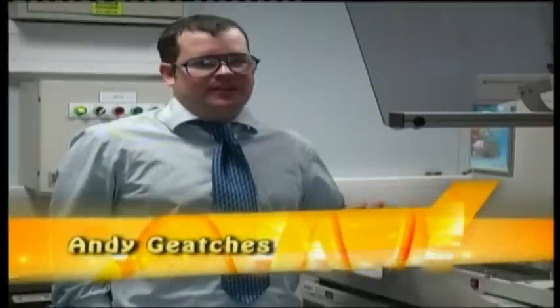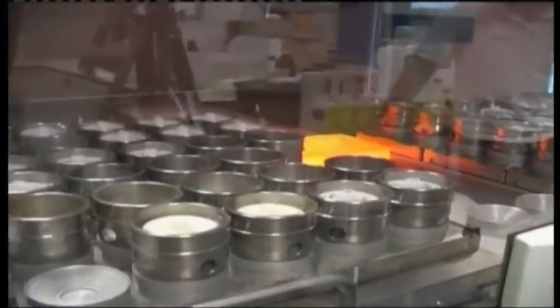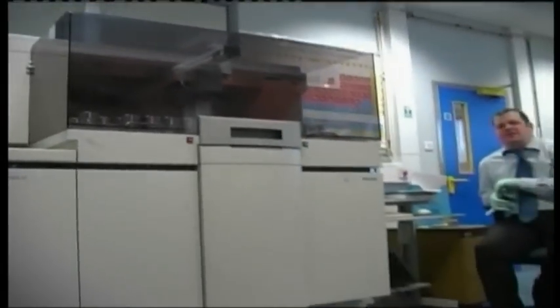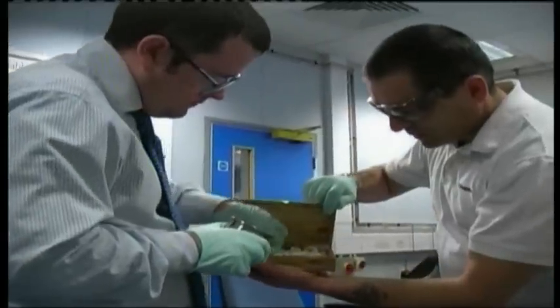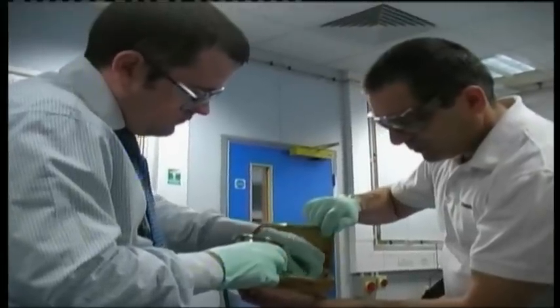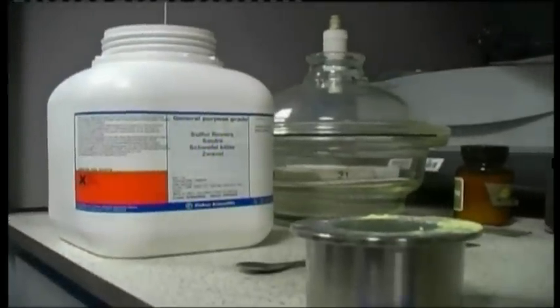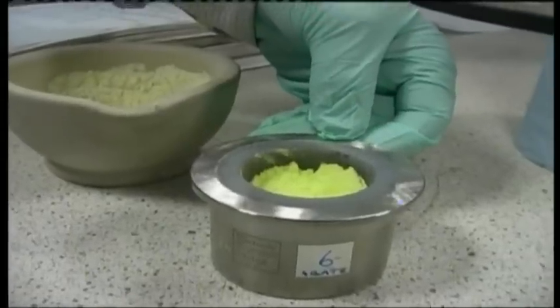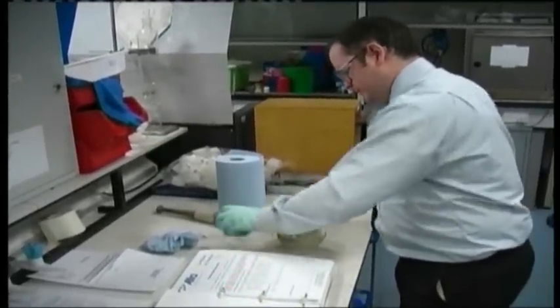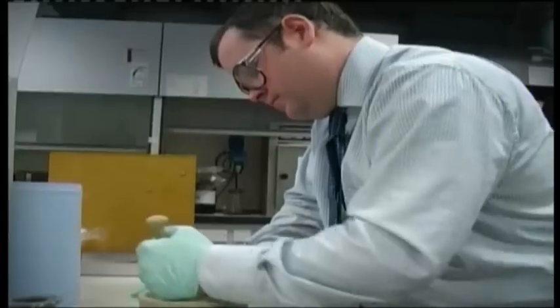An X-ray fluorescent technician was to supervise an analysis of the Brimstone samples. In order to provide a sample good enough for the precision of the X-ray fluorescent spectrometer to read, Andy had to be very thorough in his preparation. In short, Simon's Brimstone samples were to be analyzed. Then the same tests would be conducted on sulfur flowers that had been chemically refined by laboratory methods. Sulfur flowers are the purest form of the element available today, being over 99% pure. The test results are then compared in order to give a benchmark or standard so that the purity of the Brimstone samples can be ascertained.